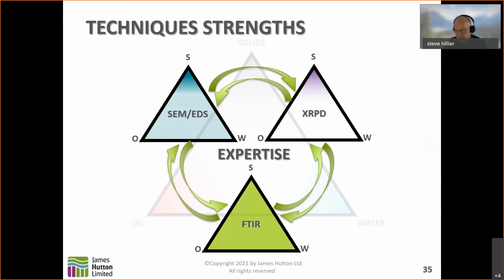Or a sample might be sent in for X-ray diffraction, for example, and it turns out just to be an amorphous pattern, which can be rather difficult to identify precisely by XRD. So we would go through and pass that to IR, where they may be able to see exactly what kind of functional groups it has present and be able to identify it straight away. And that then also might be combined with supplementary chemical information just to confirm that identification.